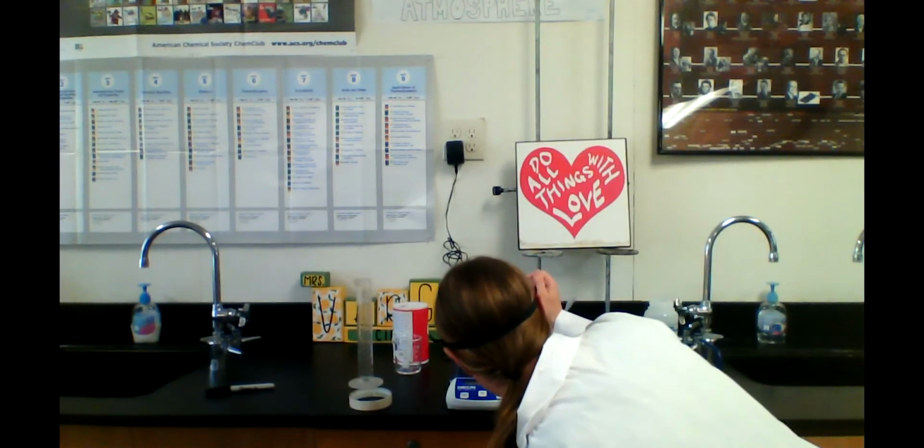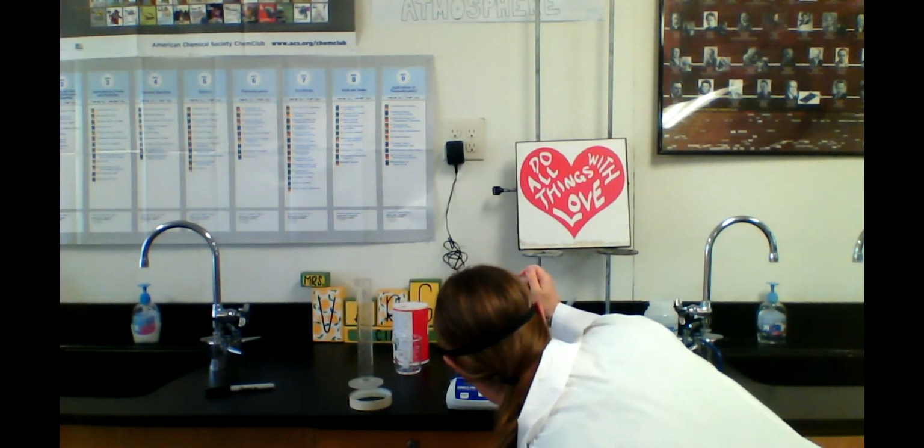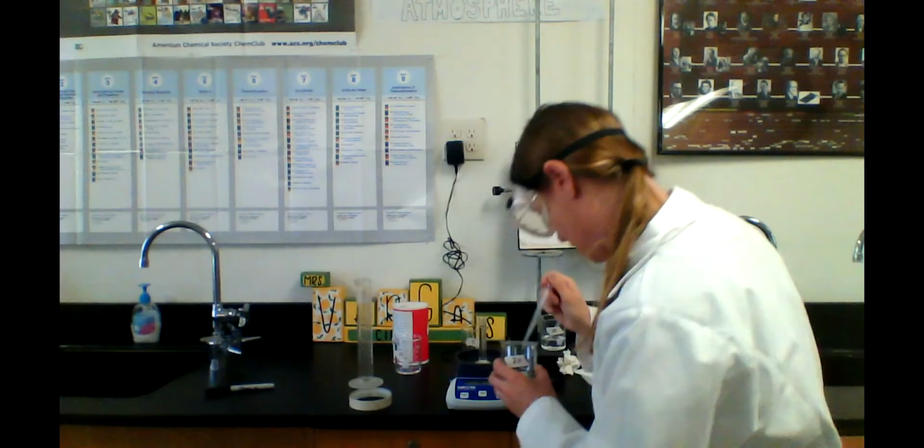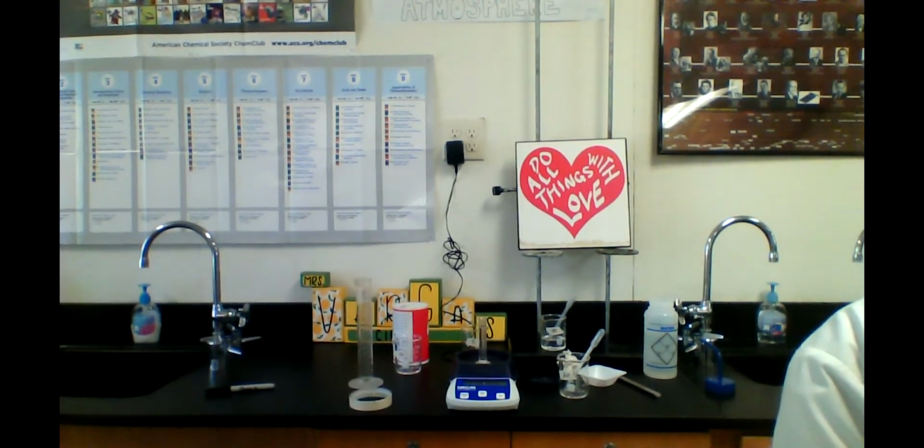While I'm doing this, you guys can think about how the results might have been affected if I had left that extra drop. Would the density have been too high or too low if I left the drop on the balance where it was? That would mean that the mass reading would be greater than expected. How would that affect density? Remember, density is mass divided by volume. Okay, and 20% has a mass of 10.99 grams. 10.99 grams in 10 milliliters.